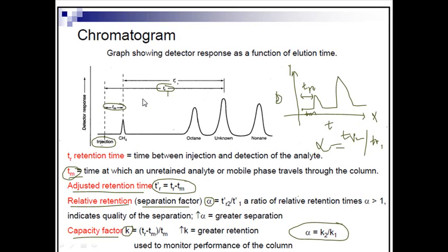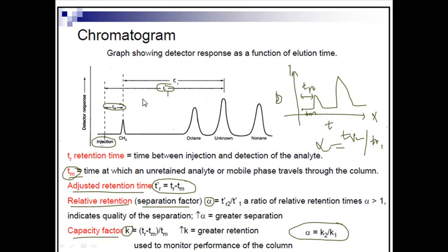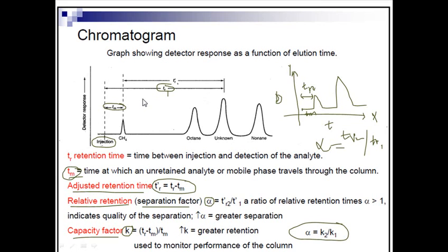If you don't understand or don't try to understand, that's fine. But you need to learn the basic concept. The concept is the map begins with a dot, with a point. The point is called the injection point, where we add the analyte which is to be analyzed.